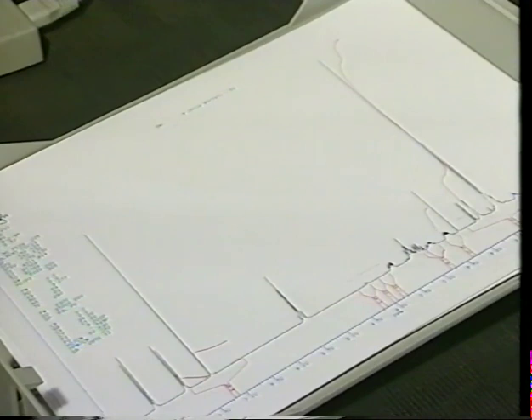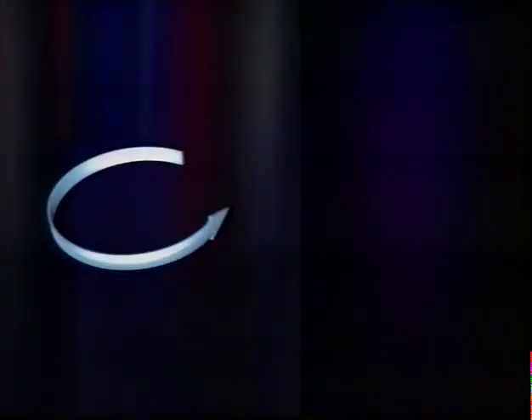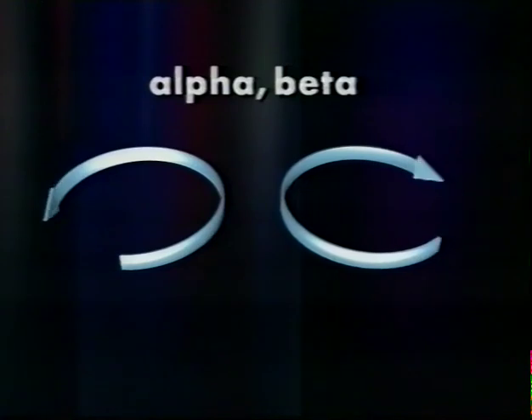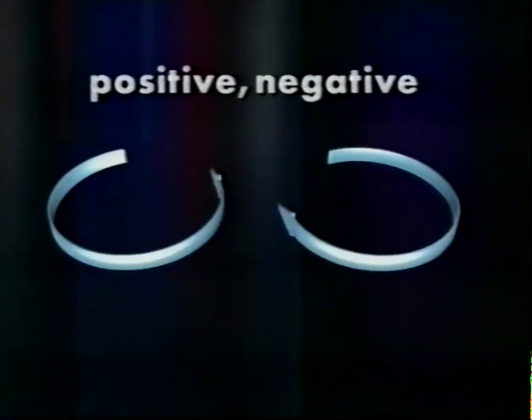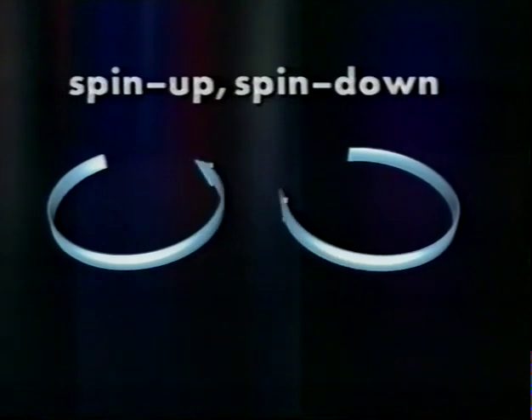NMR spectroscopy depends on a few simple physical properties. Nuclei are made up of particles that have a property called spin, and these are only able to spin in one of two ways. You may hear this called alpha and beta, clockwise and anti-clockwise, or positive and negative. But in this video we'll use the terms spin up and spin down.